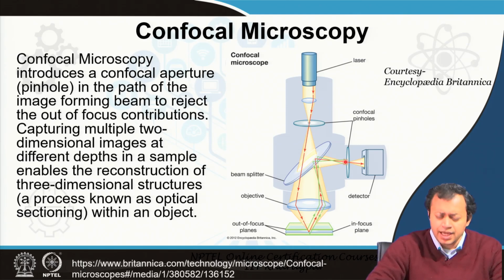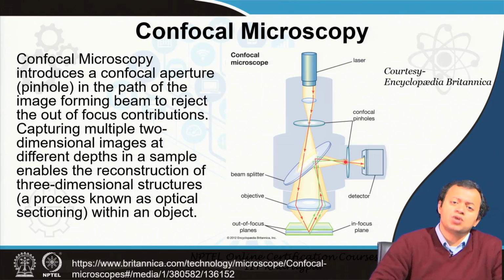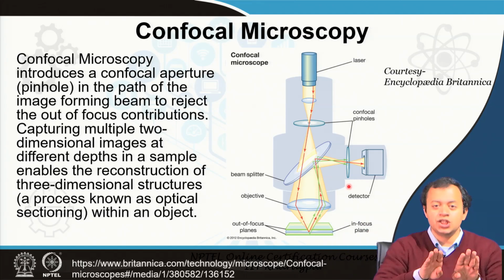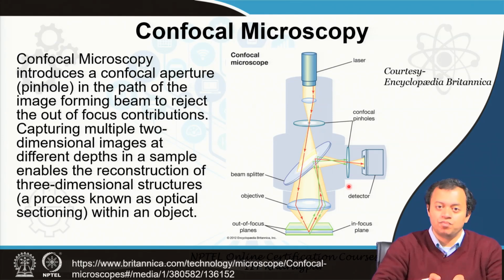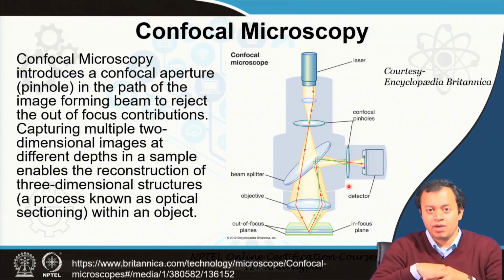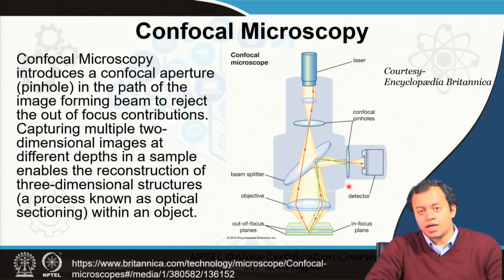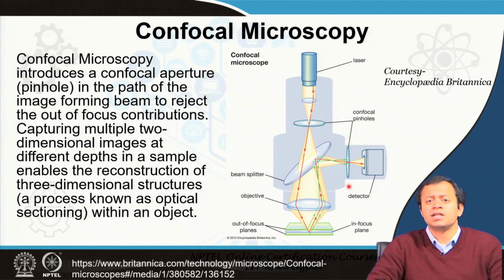Now, there is no requirement that confocal microscopy has to always be associated with scanning microscopy or vice versa. Scanning microscopy can be done without a pinhole in front of the detector, but when you combine these two techniques in laser scanning confocal microscopy, you get beautiful images with high resolution, better contrast, better brightness, higher signal to noise ratio.